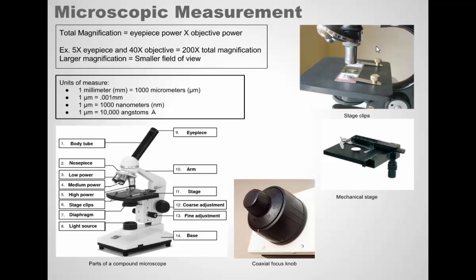As far as focus, this is a microscope that has a separate coarse adjustment knob and a fine adjustment knob. The coarse is the larger one, fine is the smaller one. Our microscopes have what's called coaxial focus in which both the coarse adjustment and fine adjustment are built into one knob. So when you turn the larger part of the knob, that's the coarse adjustment. When you turn the smaller part of the knob, that's the fine adjustment. Some microscopes turning the coarse and fine adjustment actually move the body tube up and down. Others move the stage up and down. Ours move the stage. What you're doing is you're changing the distance between the specimen and the lens and that's how you focus.